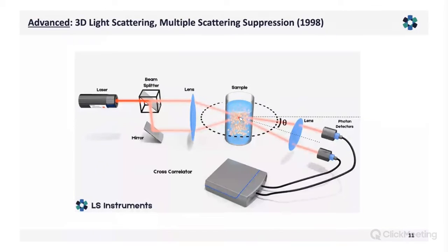Both beams are focused in the same scattering volume, and on the other side we have a lens that is symmetric to the incident lens and guides the light to the two detectors. The two detectors are vertical, such that the scattering angle is the same for the upper and the lower path. And then the analysis is essentially the same.